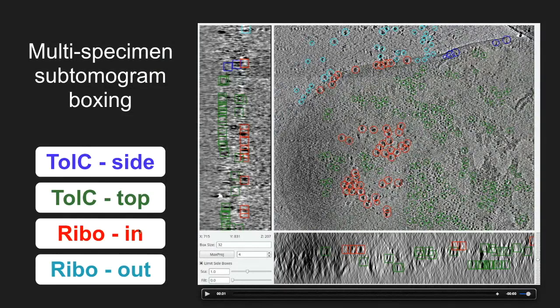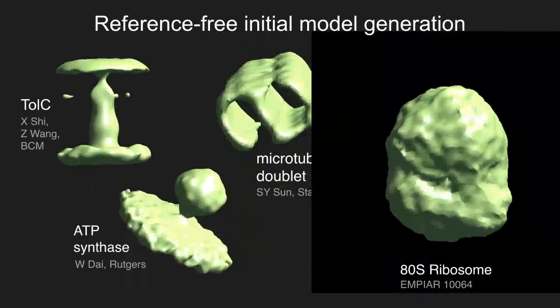We also trained on ribosomes inside the cell and trained a separate network on ribosomes outside the cell, which had escaped the cell in some fashion. And we're able to discriminate between those four different groups. This is an example of the interface. It can be used to manually update the results if you need to, or just to view the results of the automatic segmentation.